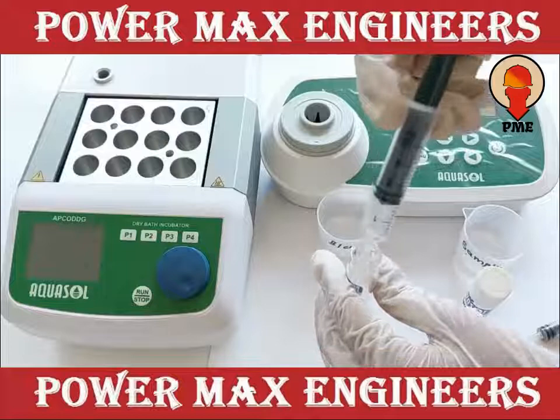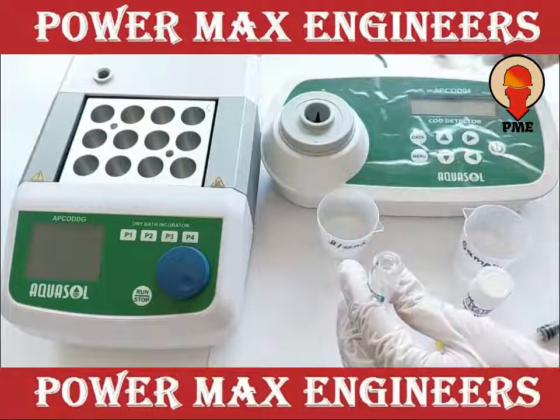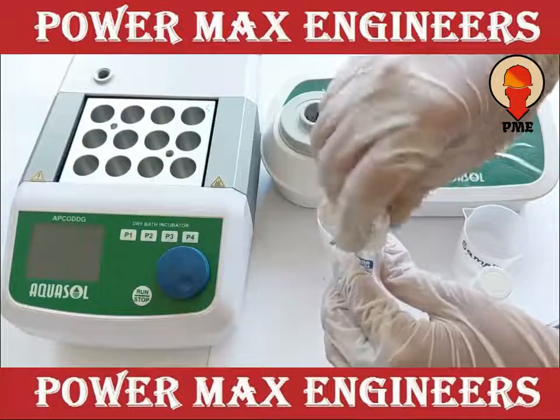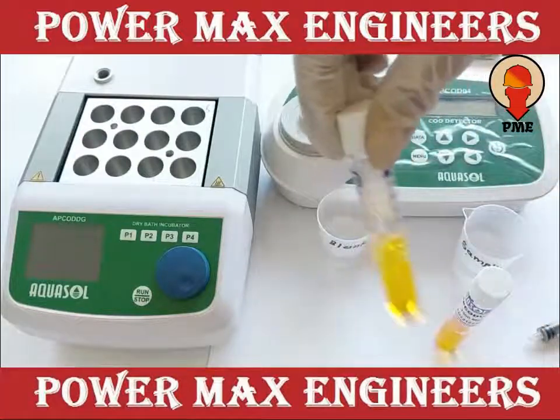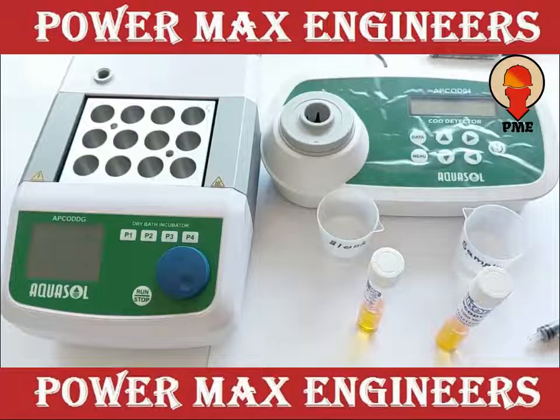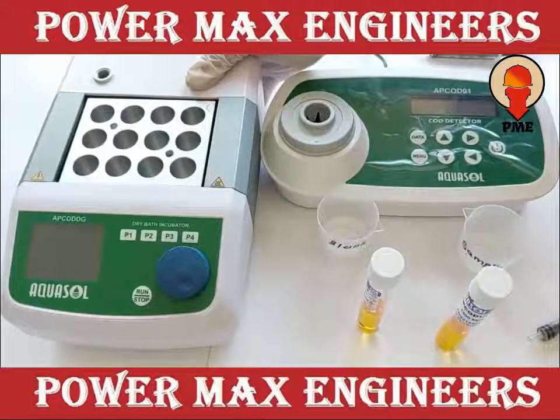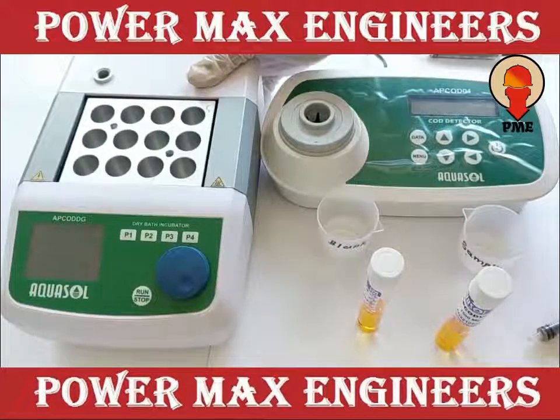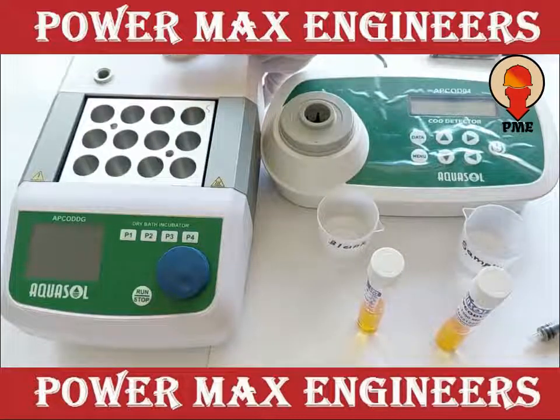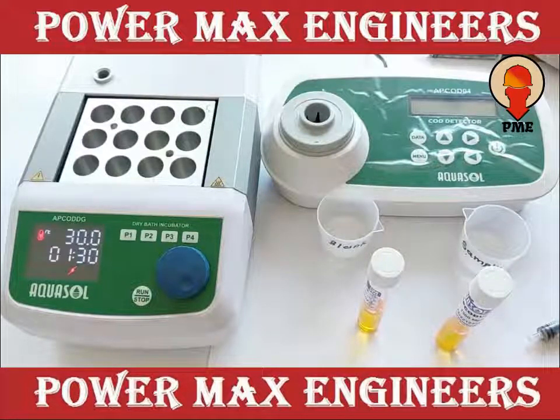Then close tightly and mix well. Now digest both the vials in the digester at 150 degrees Celsius for 2 hours. First switch on the digester and short press P1.